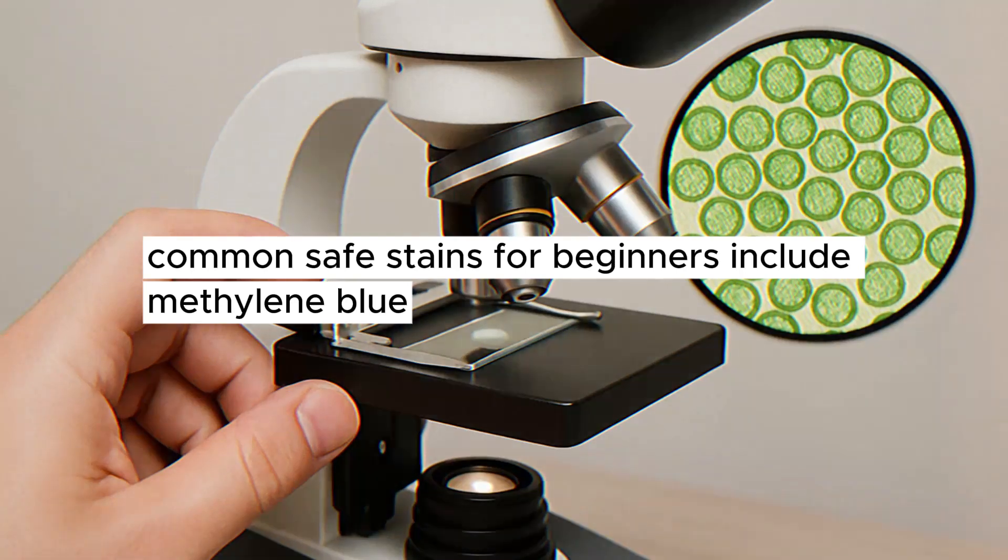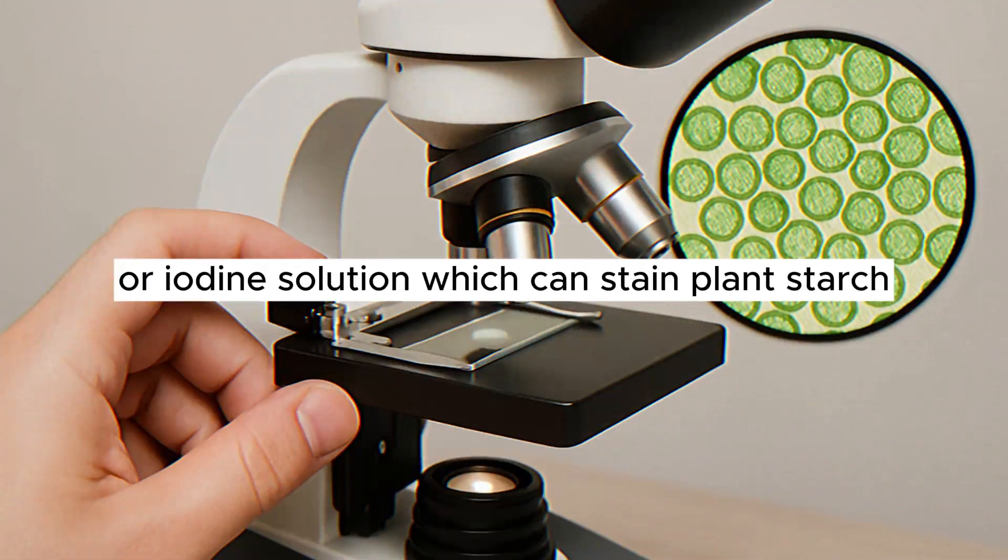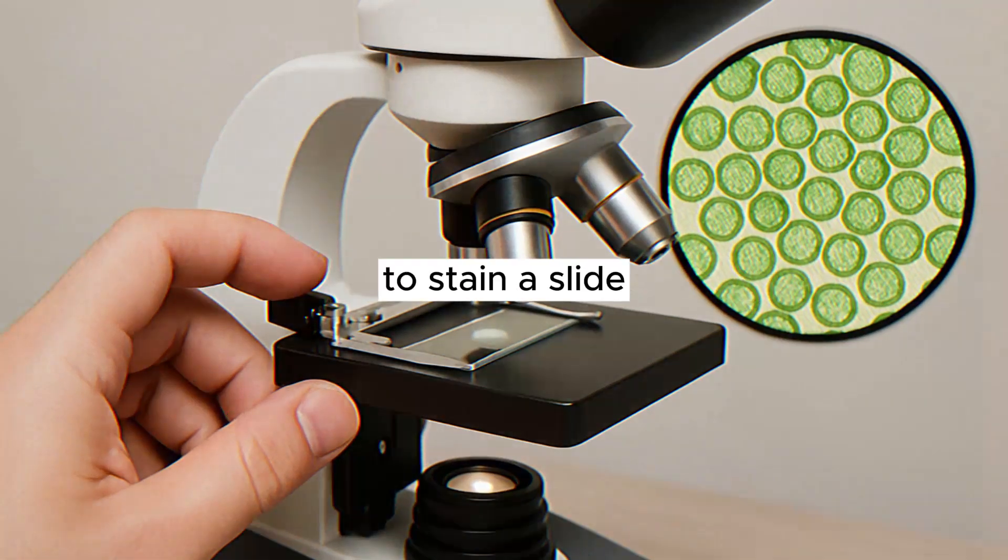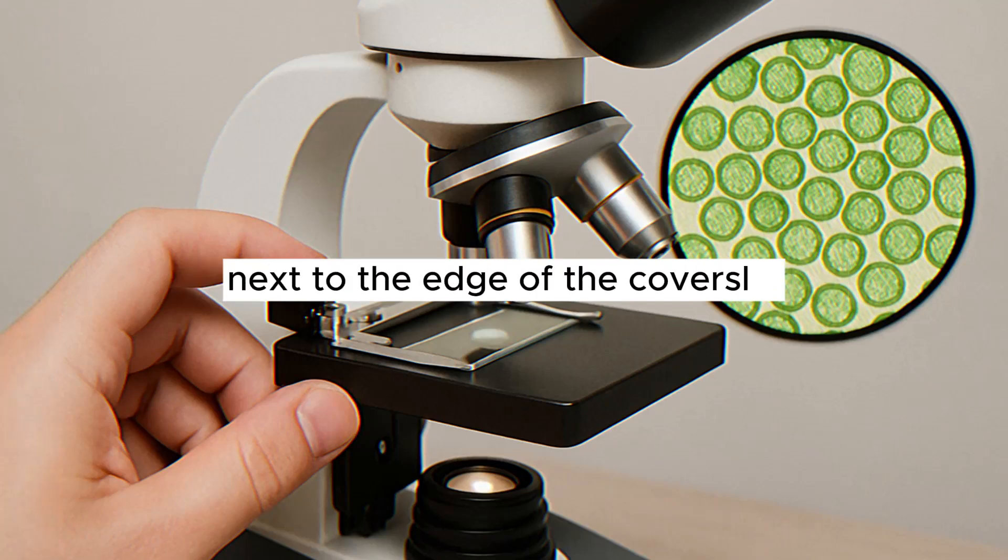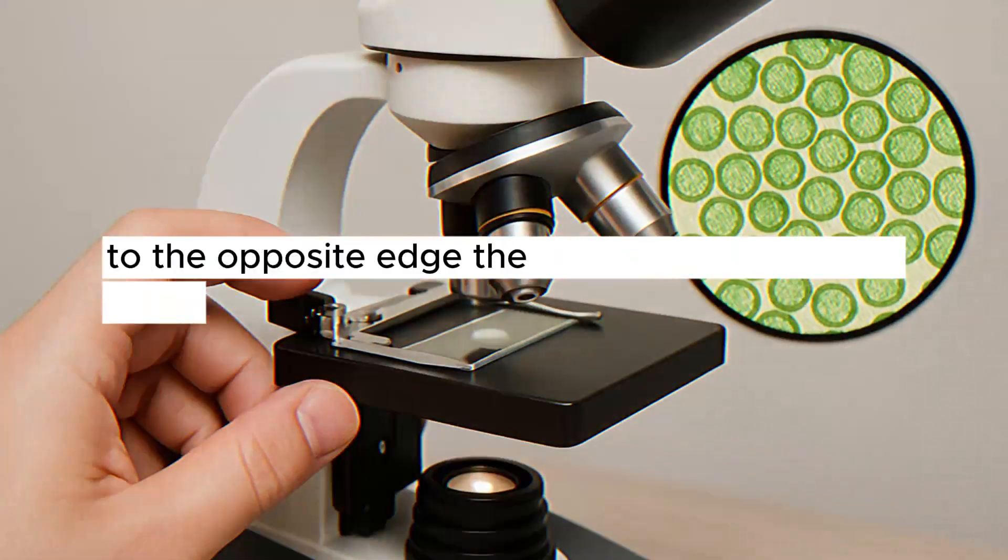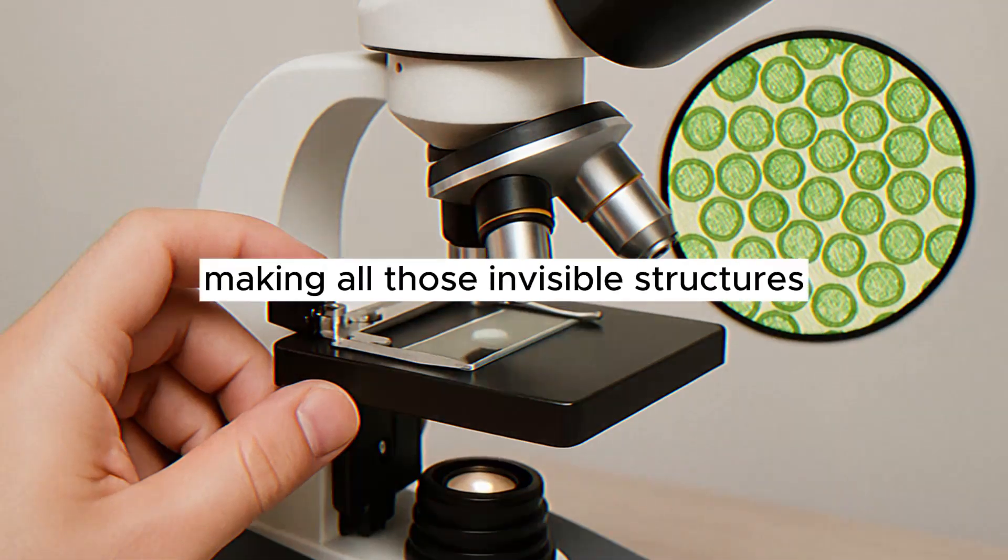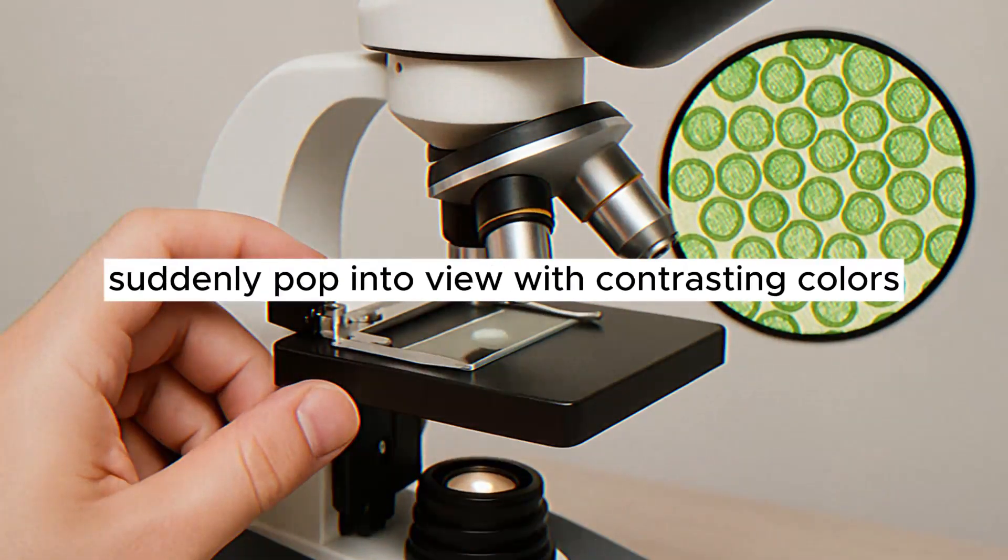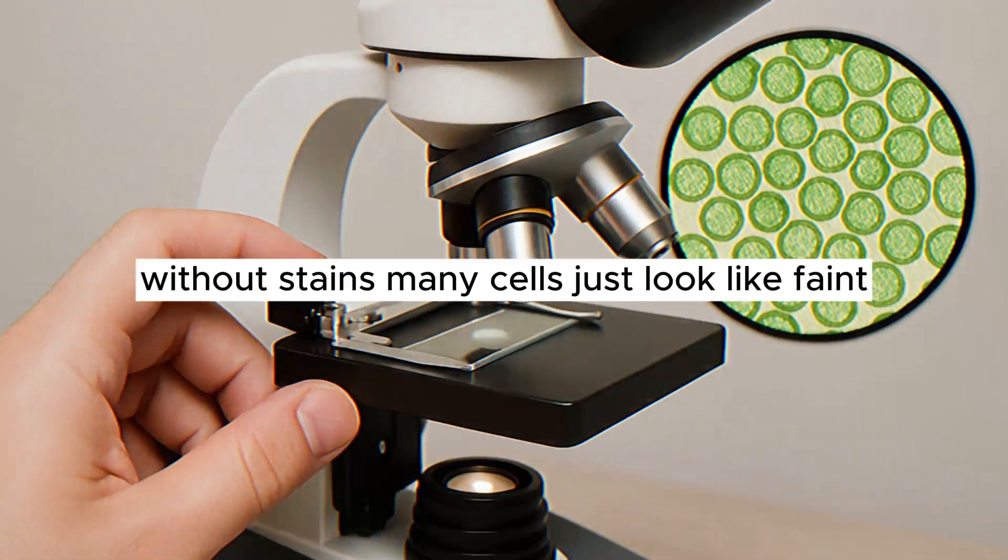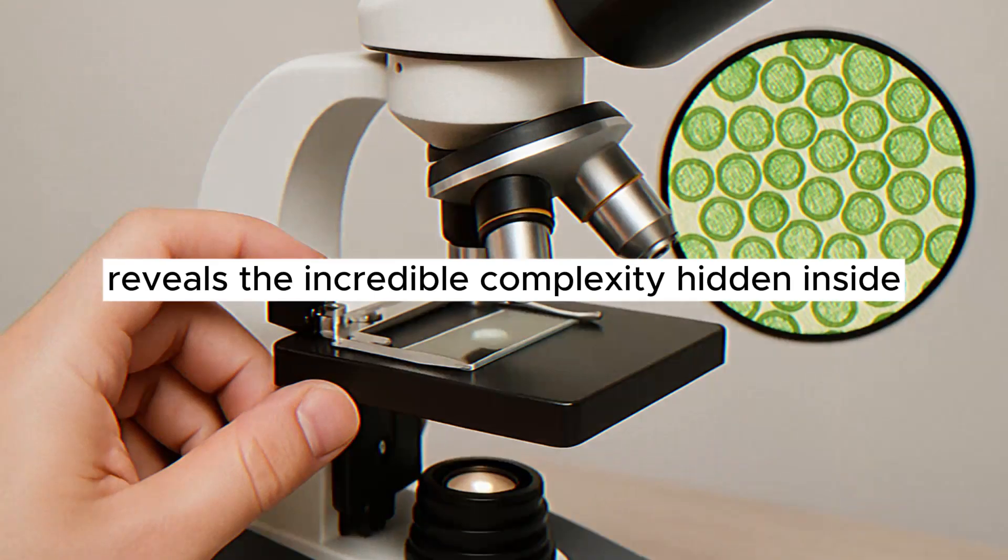Common, safe stains for beginners include methylene blue, which often makes the nucleus a dark blue, or iodine solution, which can stain plant starch or highlight structures in onion cells. To stain a slide, you often add a drop or two of the stain next to the edge of the cover slip, then carefully draw it under by touching a piece of paper towel to the opposite edge. The stain flows under the cover slip and colors the cells, making all those invisible structures suddenly pop into view with contrasting colors. It's like turning on the lights inside the cell. Without stains, many cells just look like faint, ghostly blobs or outlines. Staining reveals the incredible complexity hidden inside.